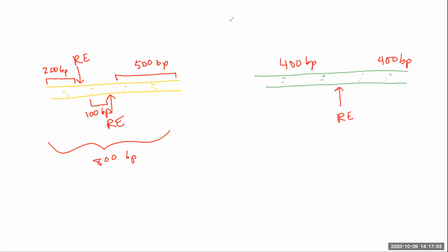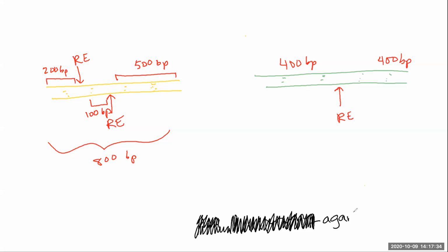Agarose is almost like Jello, right? I'm sure you've all eaten Jello at some point in your life. And that Jello is kind of loosey-goosey. It's slippery. You get it really hot and then you pour it into a mold, if you've ever made or seen anyone make a Jello mold. We can make agarose gels that, once they cool down, have a specific shape to them.